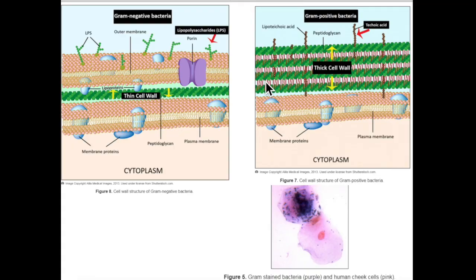We also believe that when we add decolorizer, it dehydrates the cell a little bit, and so it shrinks things. Let's go ahead and look at the image again, and imagine what we've got is crystal violet flooding into the cell, coming through the outer membrane, going into the peptidoglycan and binding to this region down here. Let's keep it simple. It's going to bind to the cell membrane and within the peptidoglycan. It's going to be everywhere, all up here, but let's focus on this area.